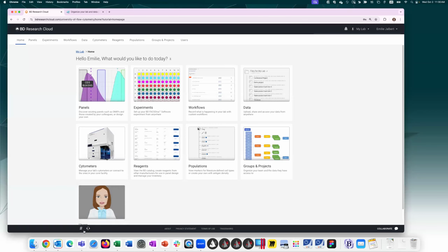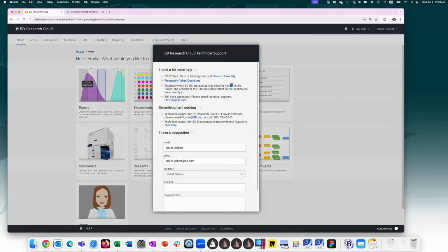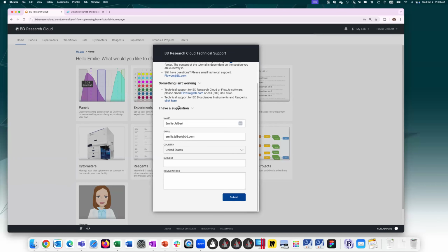While we're down here, there's a tech support button that I can click. So if you need a bit more help, these are the videos from FlowJo University. You can click there, it'll bring you to that site. Frequently asked questions. And if you have any suggestions to make, feel free to contact me here as well.